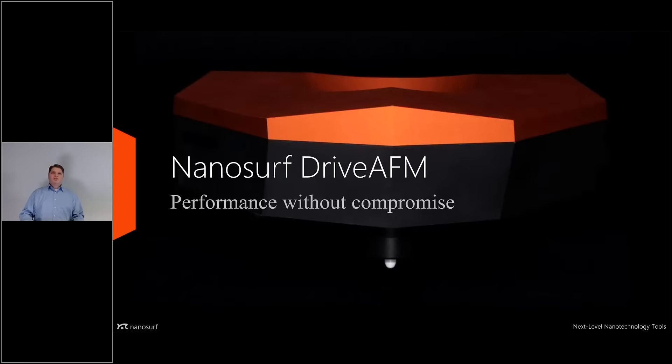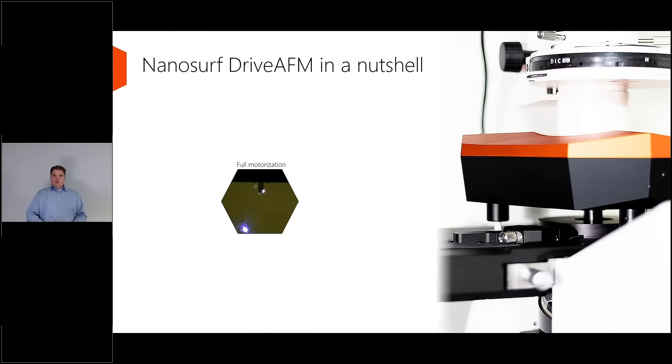The DriveAFM in a nutshell. We have the full motorization which provides a lot of ease of use but also has a lot of automation capabilities for the different users and different use cases.